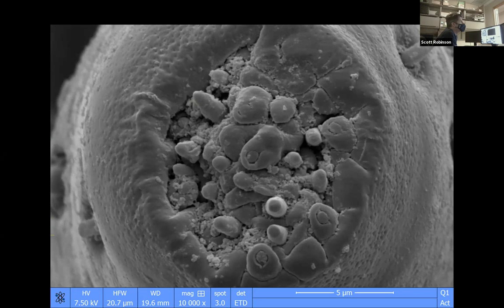So an optical microscope is limited by light, and light has certain wavelengths; the colors range from 400 to 700 nanometer wavelengths. And so we have glass lenses, and in the microscopy suite, we have lots of light microscopes. Those still get used, and we have lots of different versions of those. We also have 3D X-ray capability, which Josh uses sometimes.